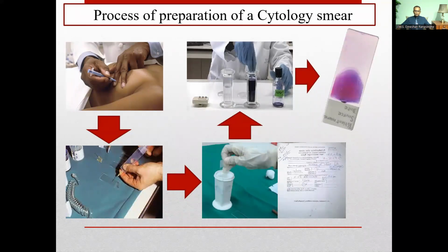So really speaking, we can issue a report if you really need it in 1 hour's time. From the time of fine needle aspiration, it should be 20 minutes for the fixation to happen, and the staining, preparation of the slide and reporting will take the rest of the time. So in 1 hour's time, we can type it and issue it. So the process is relatively short.